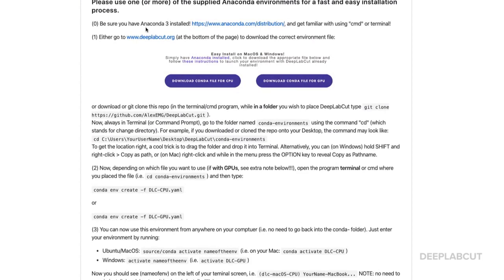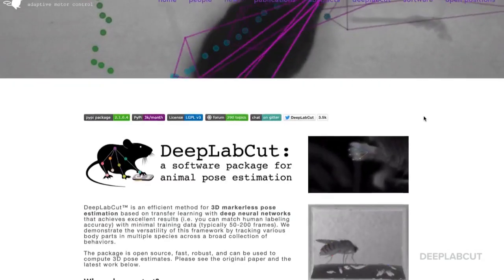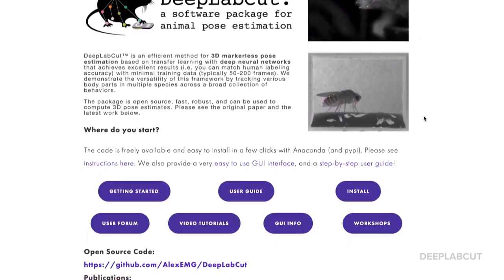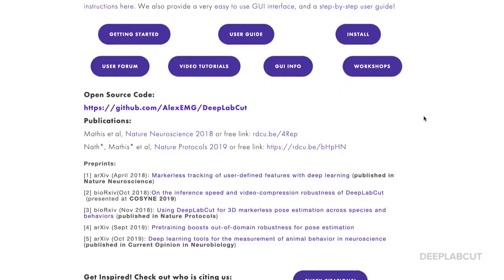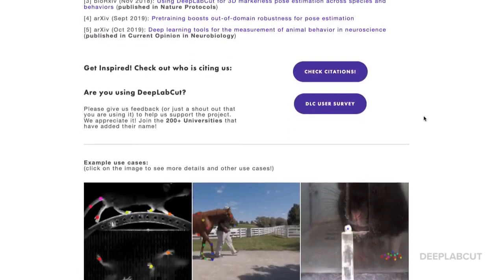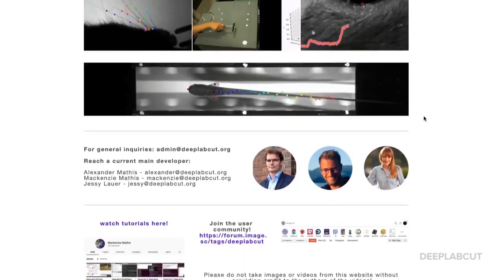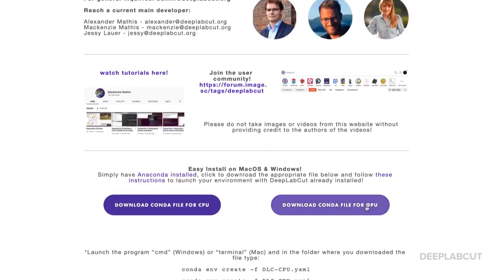Now, if you click on the link, we can see two options. One is going back to the main website, where at the very bottom you'll find two buttons that allow you to download the specific Anaconda environment files for DLC CPU or DLC GPU use.